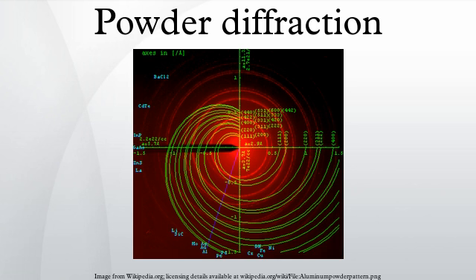for a tetragonal phase, but if the symmetry becomes cubic the two peaks will come to coincide. Crystal structure refinement and determination. Crystal structure determination from powder diffraction data is extremely challenging due to the overlap of reflections in a powder experiment. A number of different methods exist for structural determination, such as simulated annealing and charge flipping. The crystal structures of known materials can be refined, that is as a function of temperature or pressure, using the Rietveld method. The Rietveld method is a so-called full pattern analysis technique.